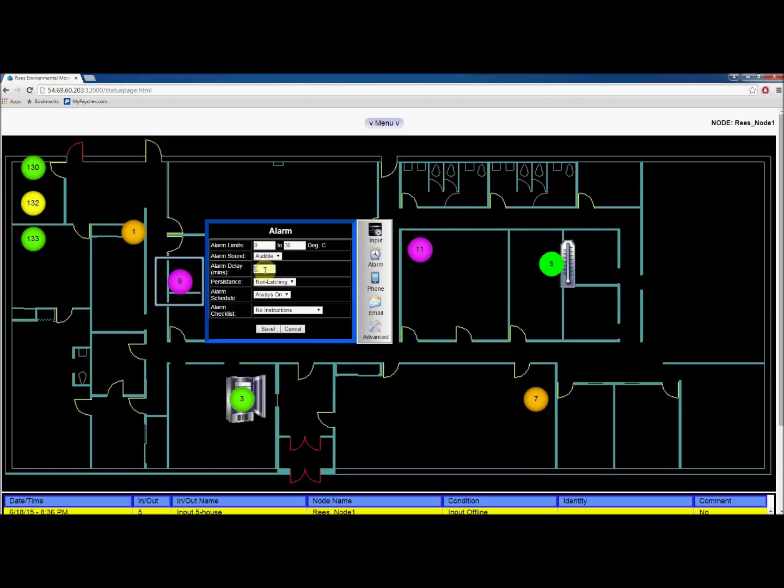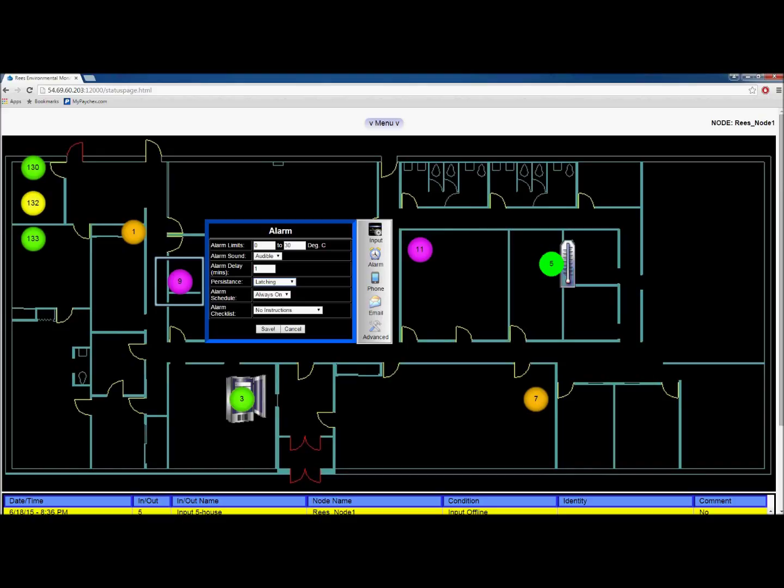In the next box, you can add a delay timer for alarm notification. Choose whether you want a latching alarm or a non-latching alarm in the next box. If an input goes into alarm, a non-latching alarm will turn off when the input falls back into range. If you choose latching, it will remain in alarm until a user acknowledges it.